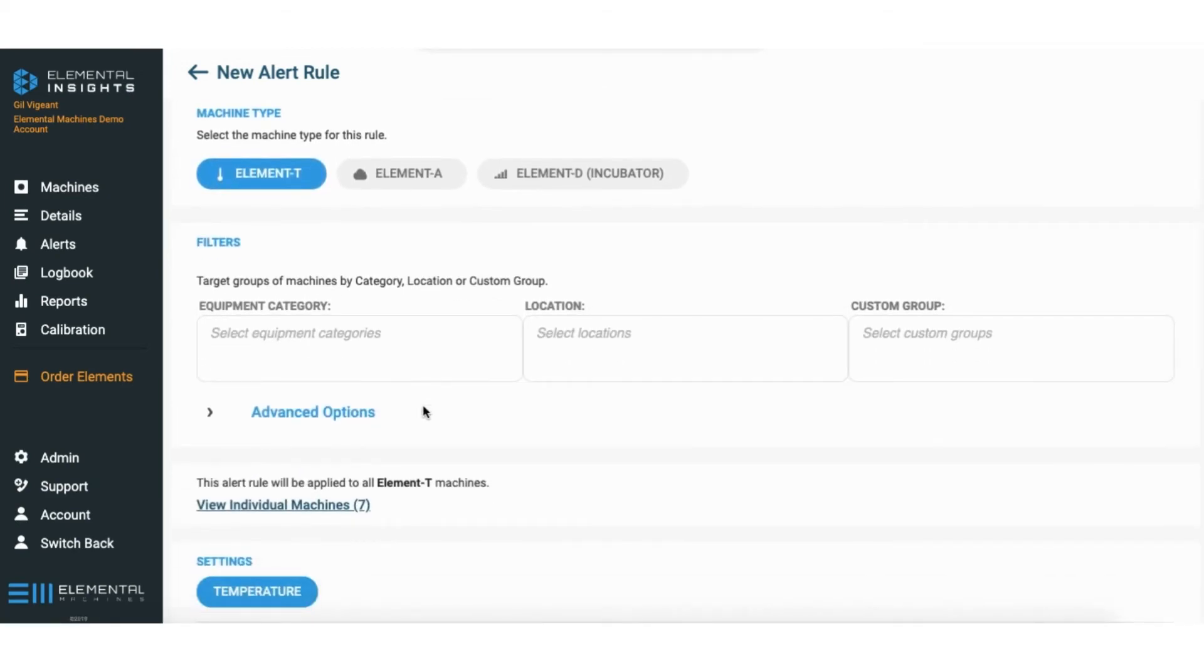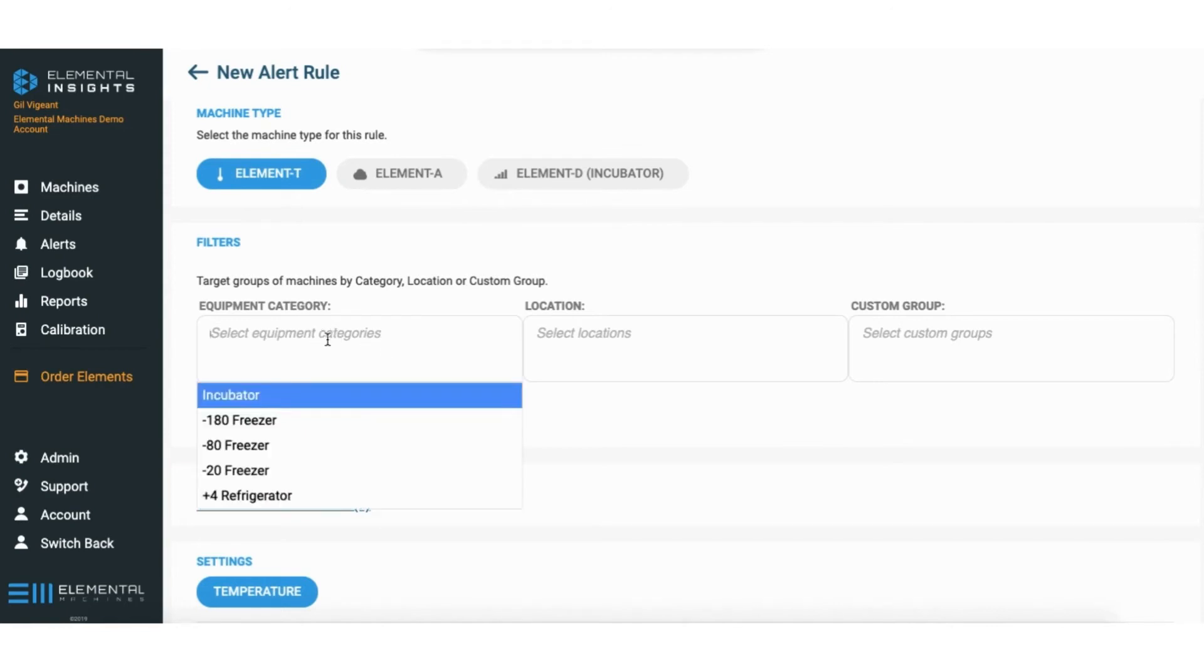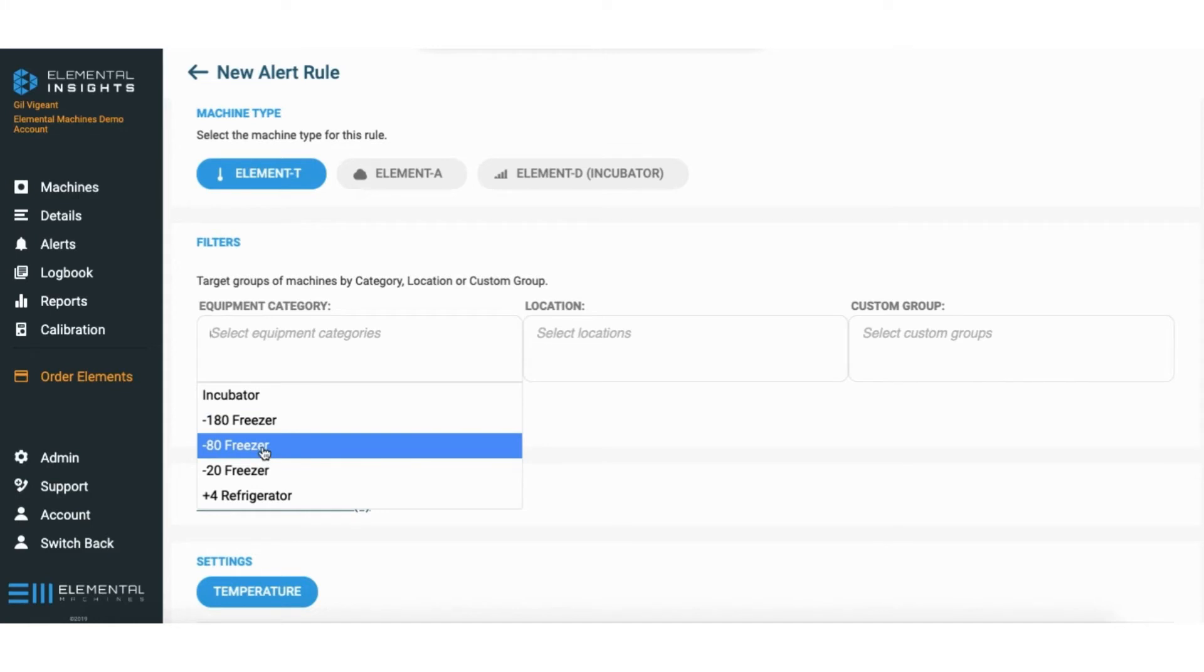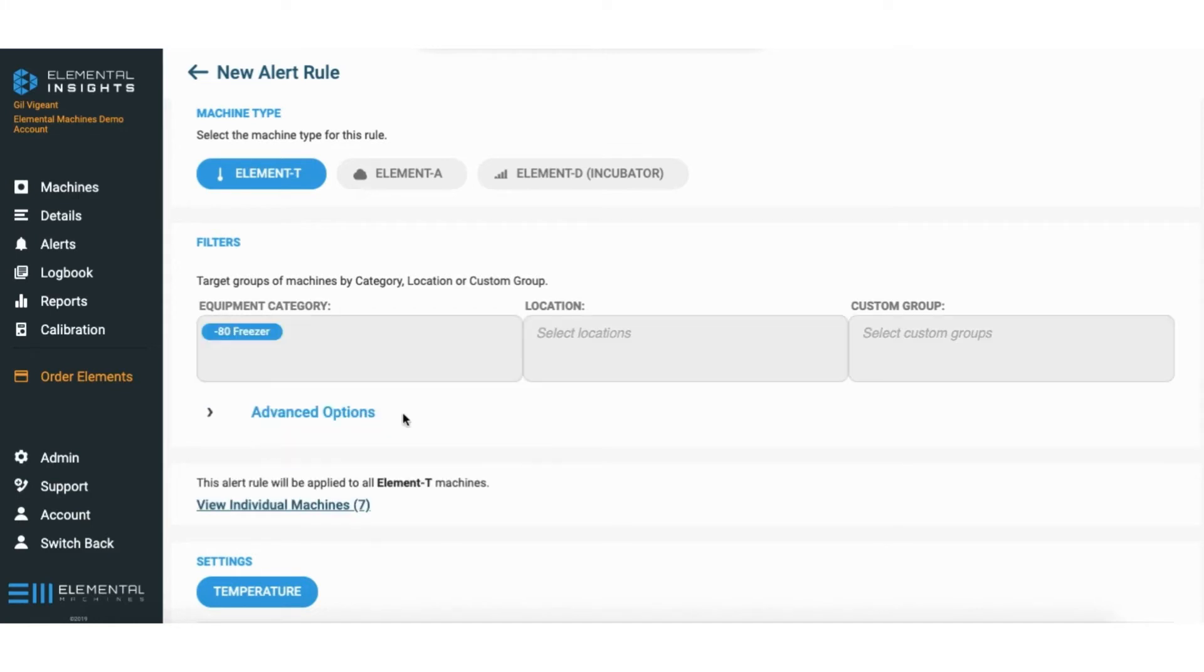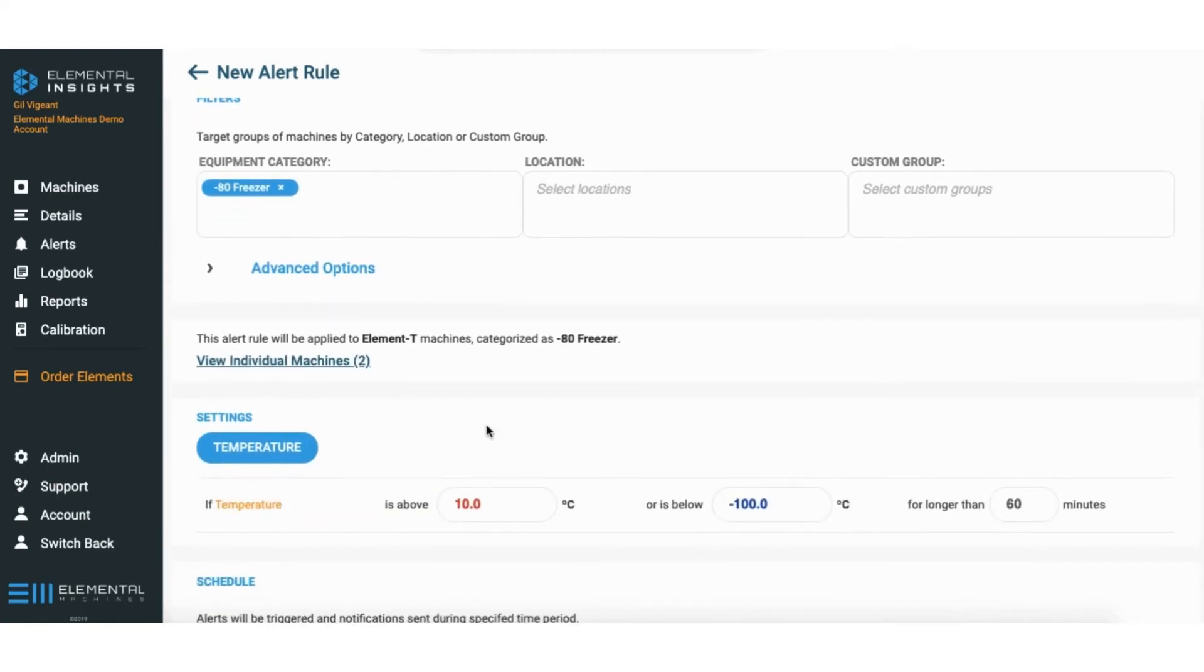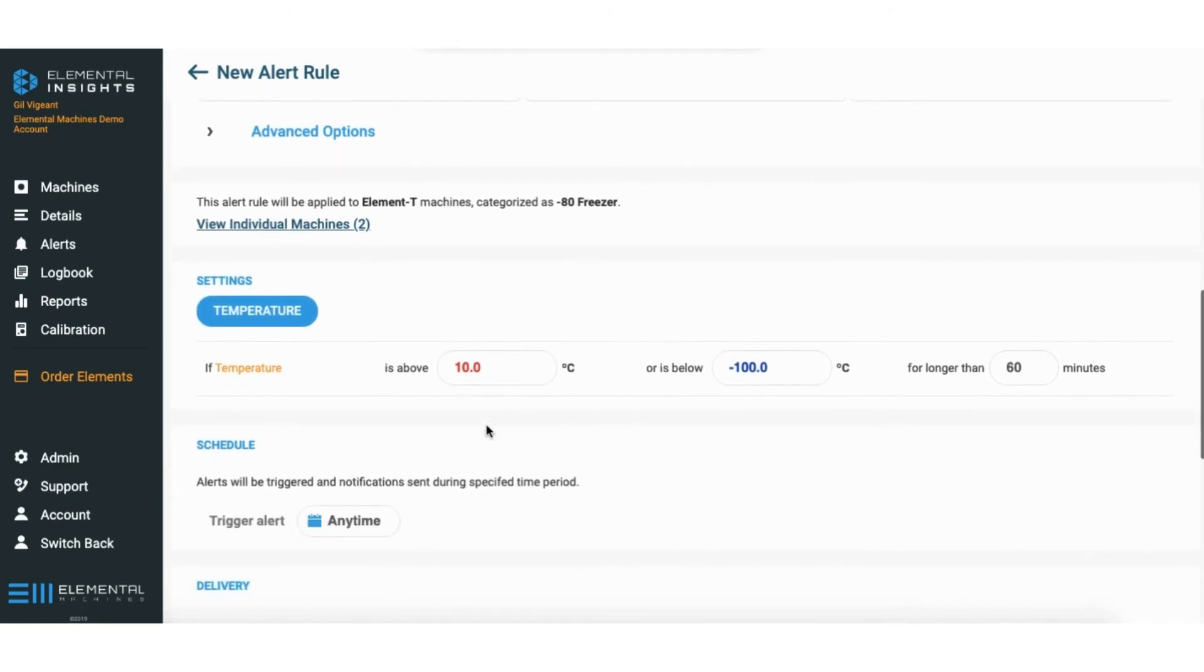It could be plus 4 fridges, minus 20, so on and so forth. But as this is going to be for my minus 80 freezers, I want to click right here under equipment category. This is going to make this rule apply across all my minus 80s, and any minus 80 I add in the future will automatically jump onto this rule.